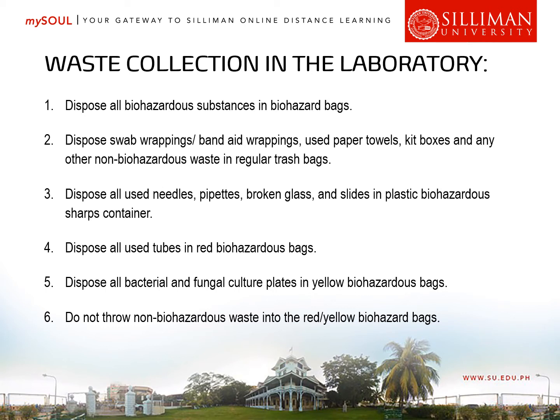For waste collection in the laboratory, these are the following things that we need to remember. Number one, dispose all biohazardous substances in a biohazard bag. Usually in the laboratory, all infectious wastes or pathological wastes are placed inside a yellow bag or a yellow waste receptacle. Number two, dispose swab wrappings, band-aid wrappings, used paper towels, kit boxes, and any other non-biohazardous waste in regular trash bags. Usually, the color of the trash bag for this one is the black colored container for non-infectious waste.